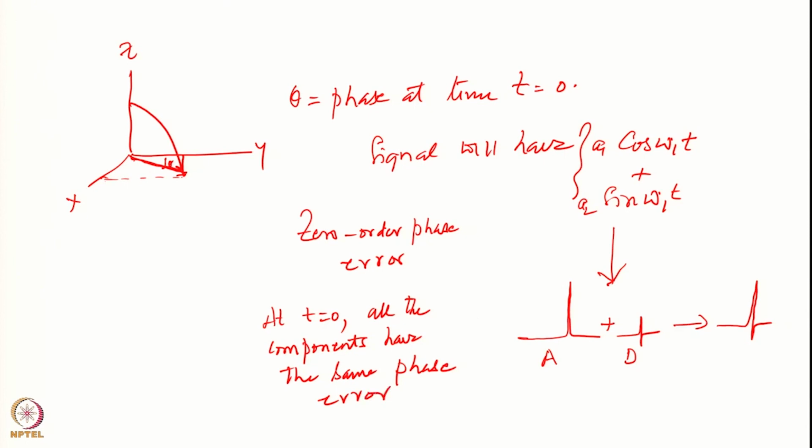And this is in the real part. The imaginary part similarly will have a pure dispersive component and also a small absorptive component. Okay. So, the trick in correcting the phase will be to mix these two appropriately, so that the dispersive component from the absorptive signal will vanish, and likewise the absorptive component from the imaginary part will vanish. Okay. So, that is the idea.